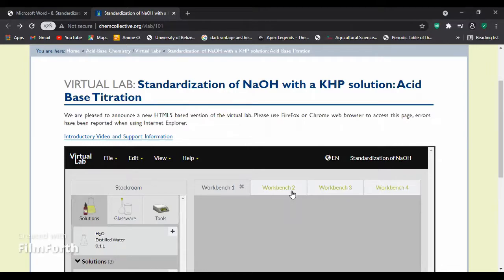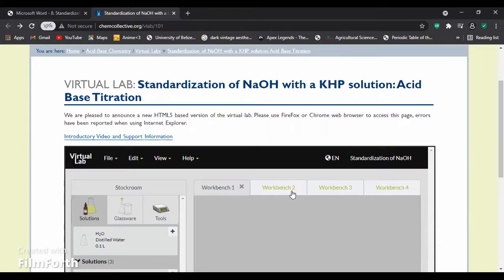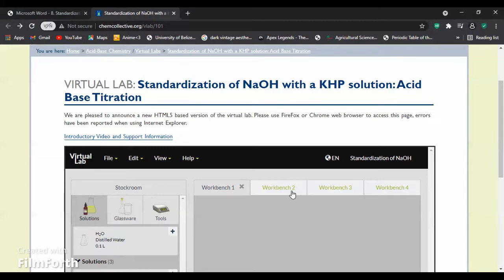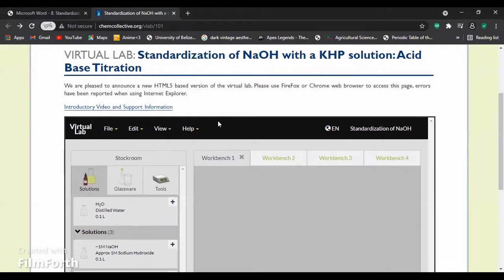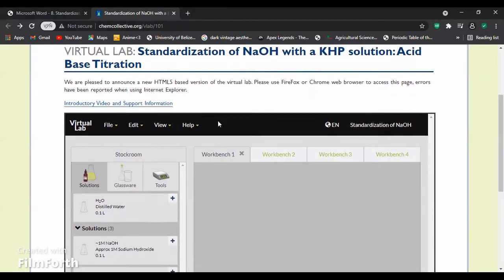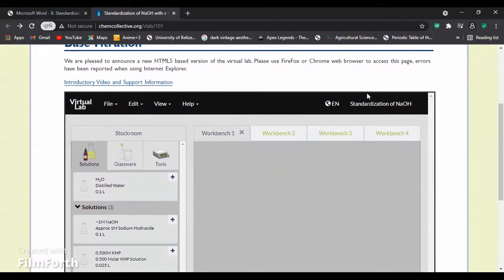Hello, my name is Jocelyn Koh. Today I'll be conducting a virtual lab to standardize NaOH, which is sodium hydroxide, with KHP, which is potassium hydrogen phthalate. This is acid-base titration, so we will now proceed.